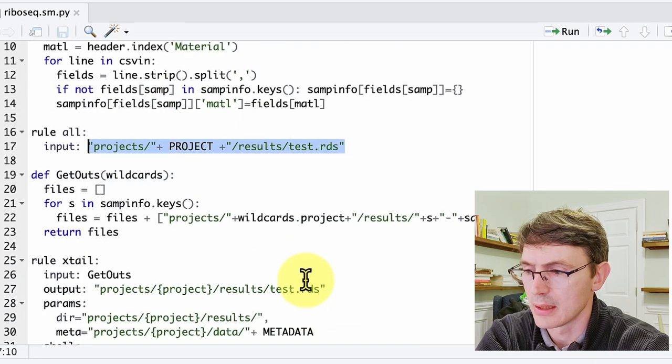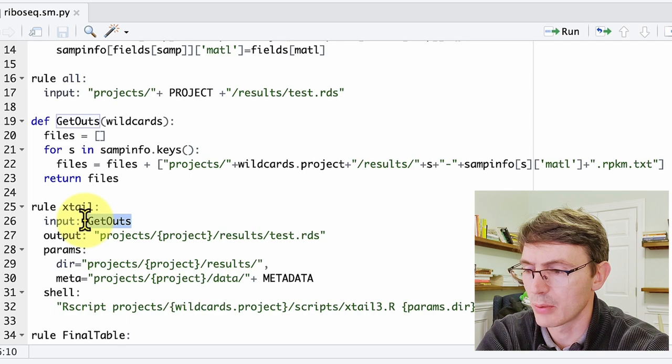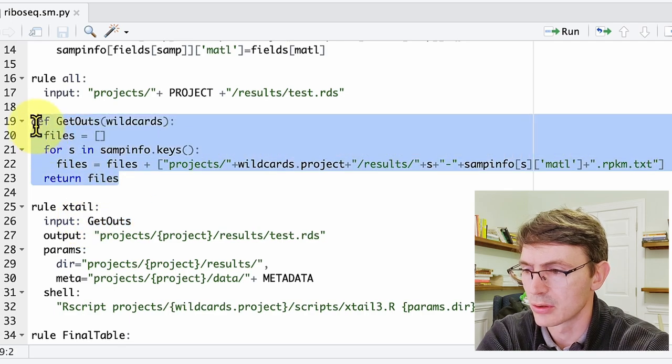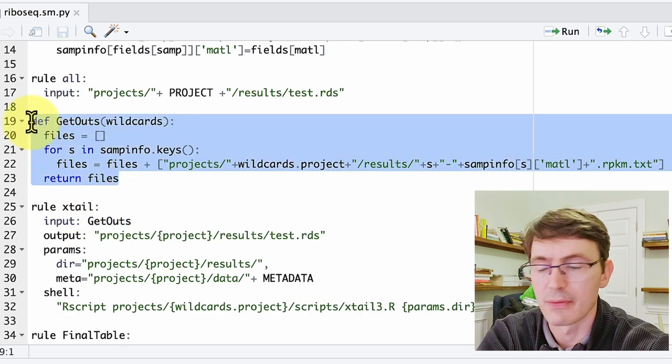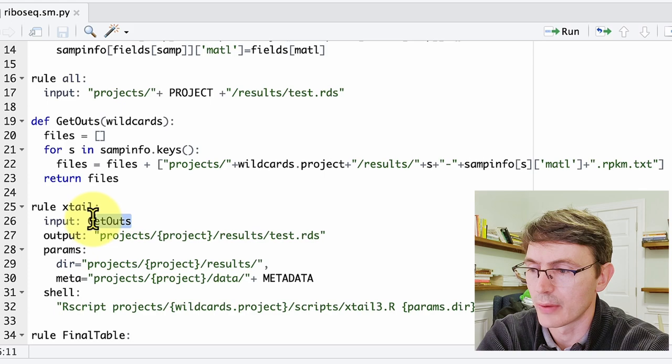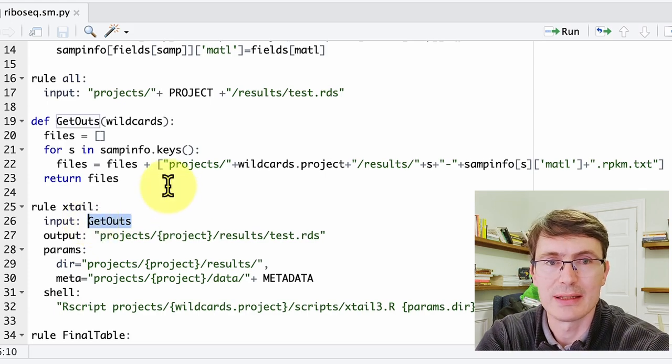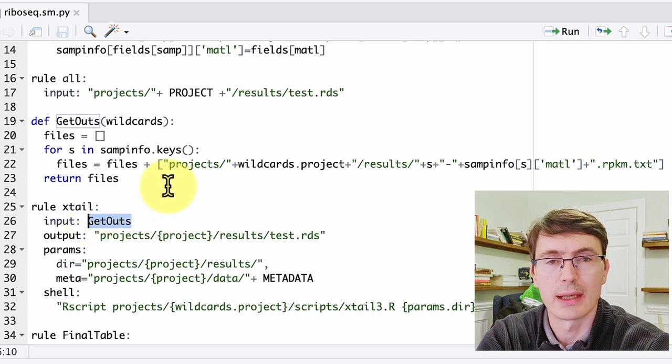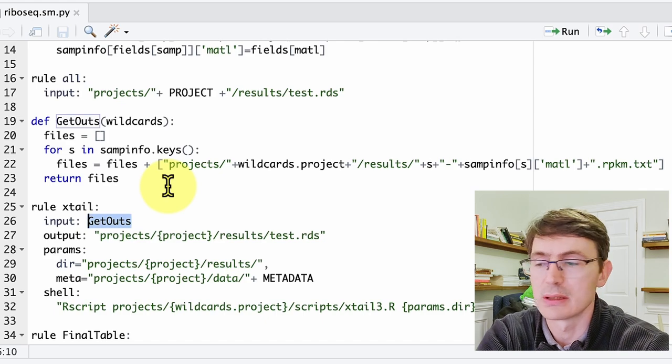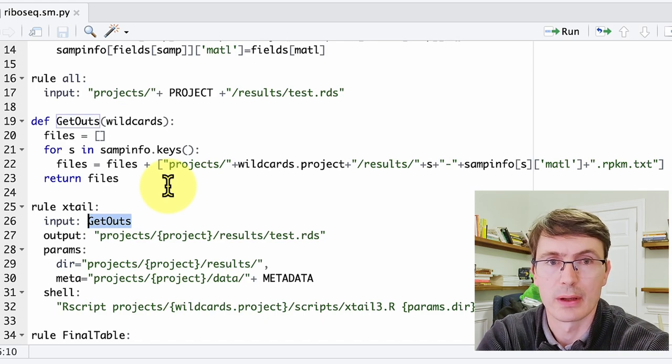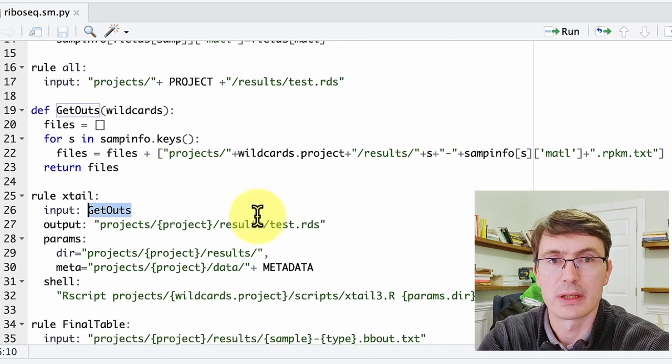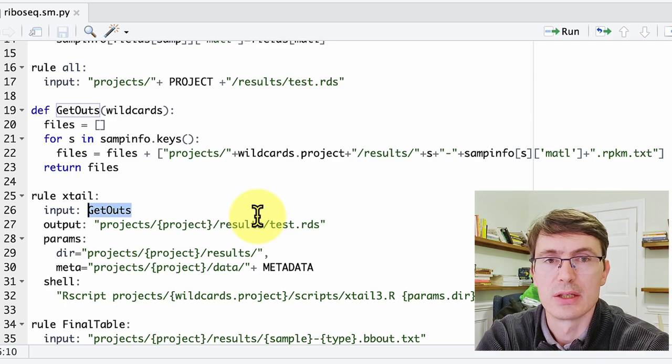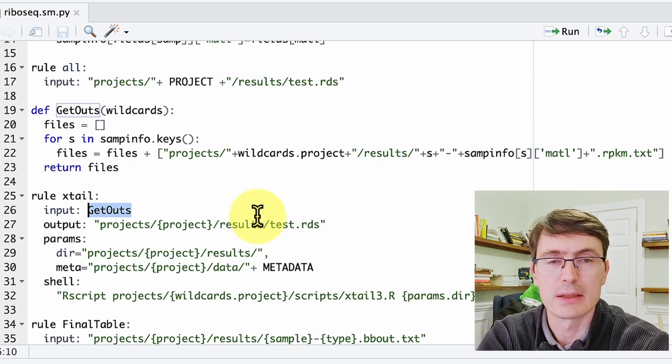Right, so now let's move to the second rule starting from the end, this xtail rule. But before that, we have to deal with this function here that is the function that defines the inputs of xtail. So this function generates the list of all the count tables that will be fed into this xtail rule and ExtAil program. The first thing to note is that this function generates a list of files, and the second one is that it's taking wildcards as a parameter.